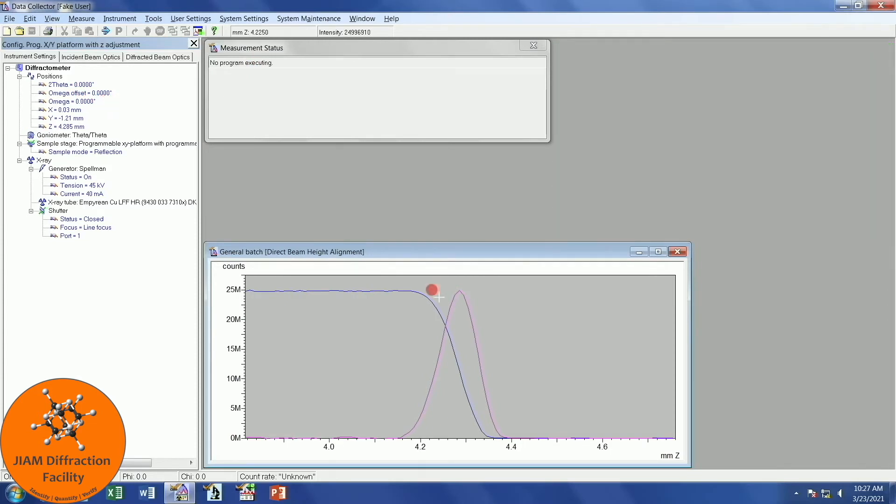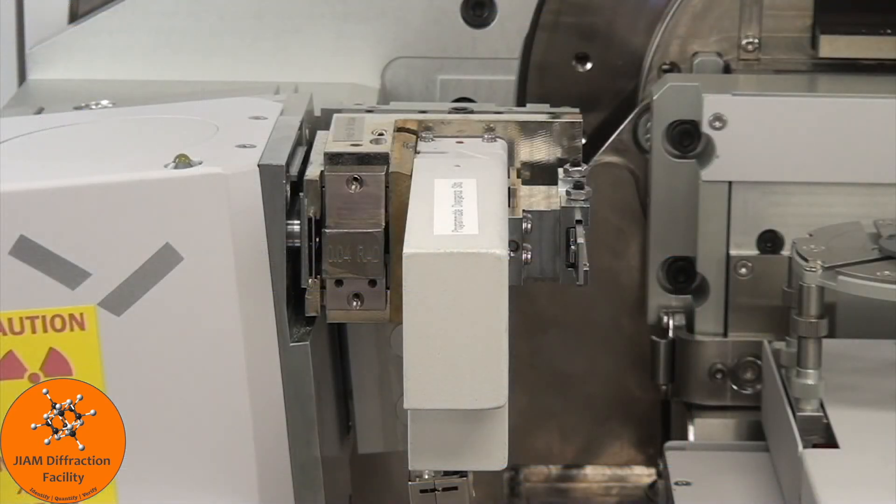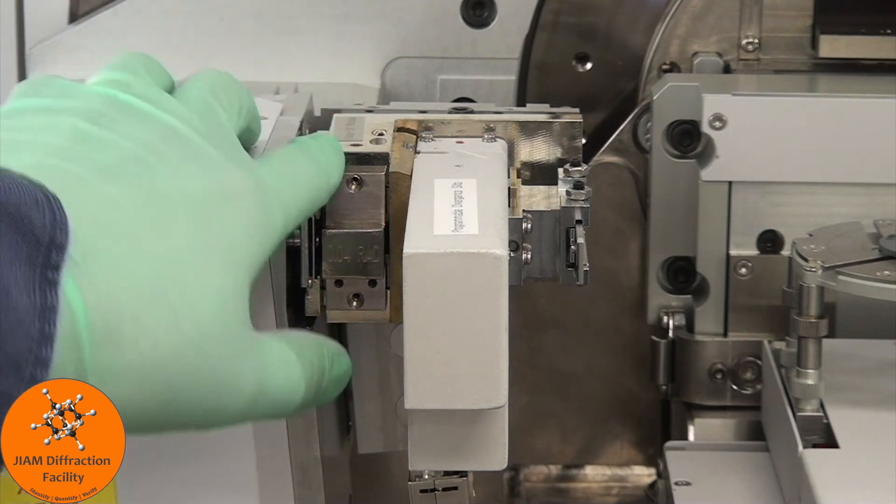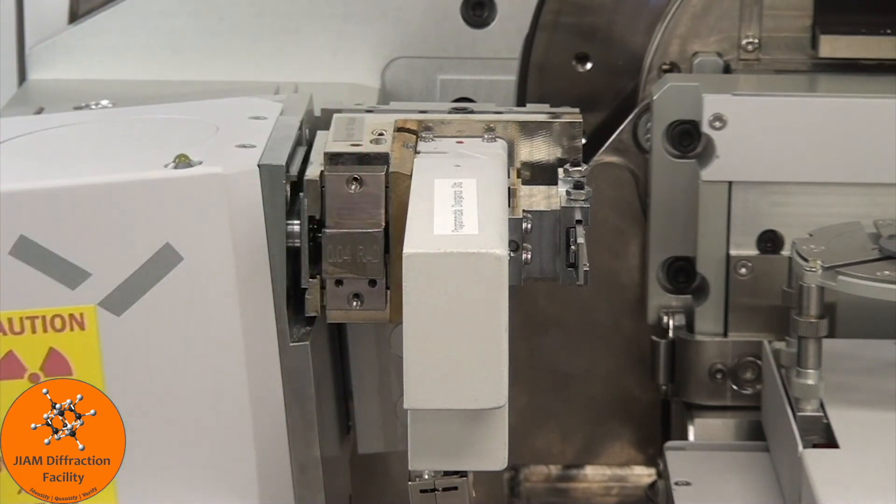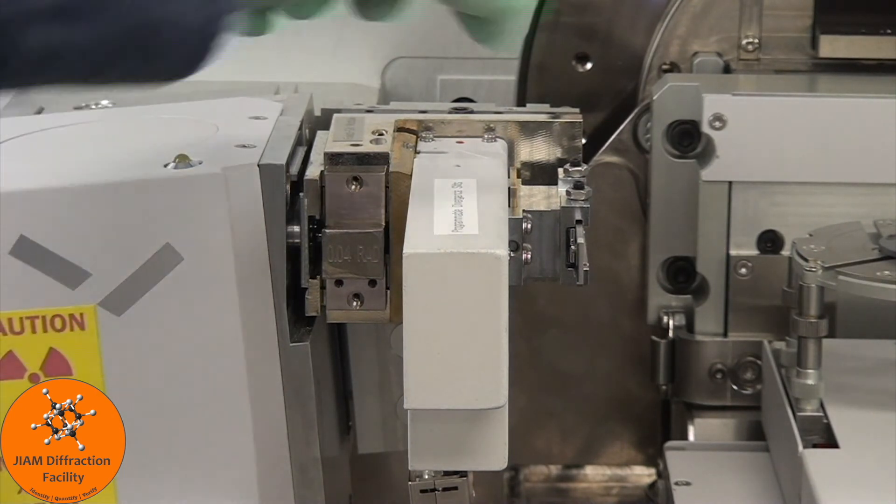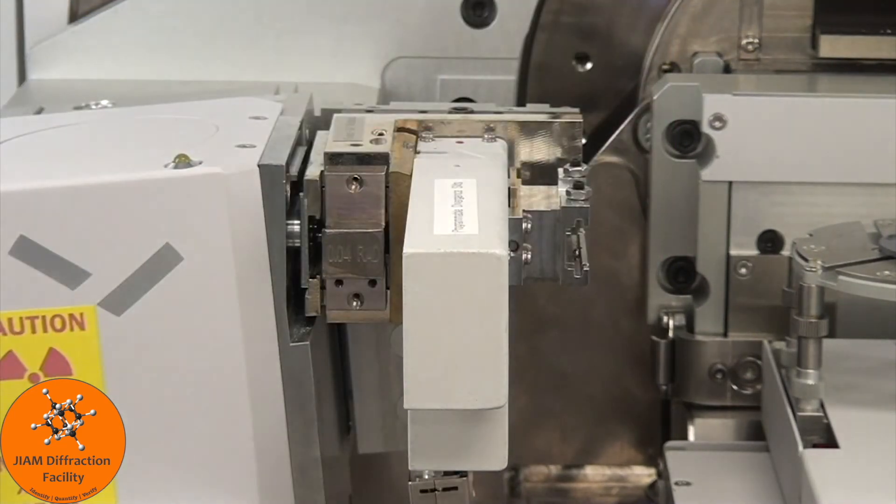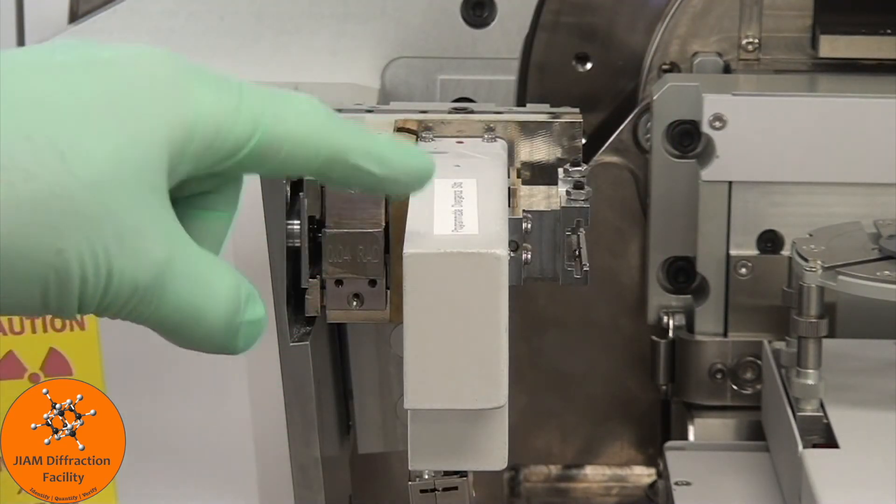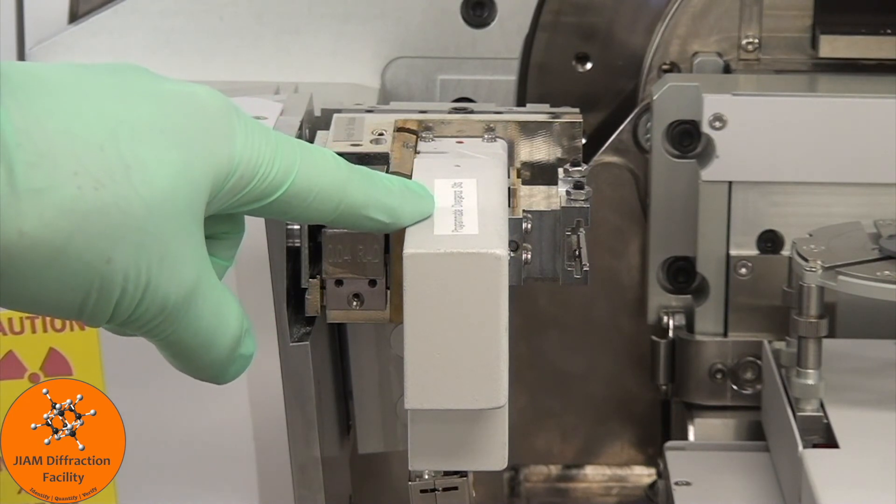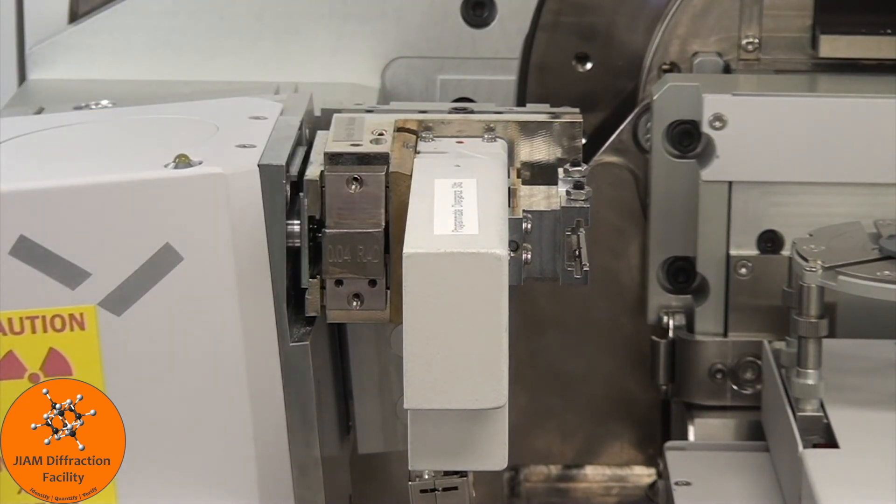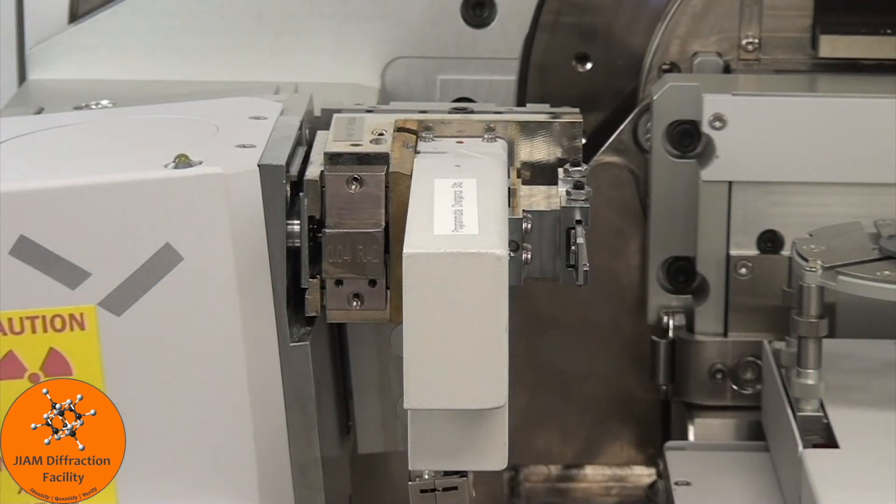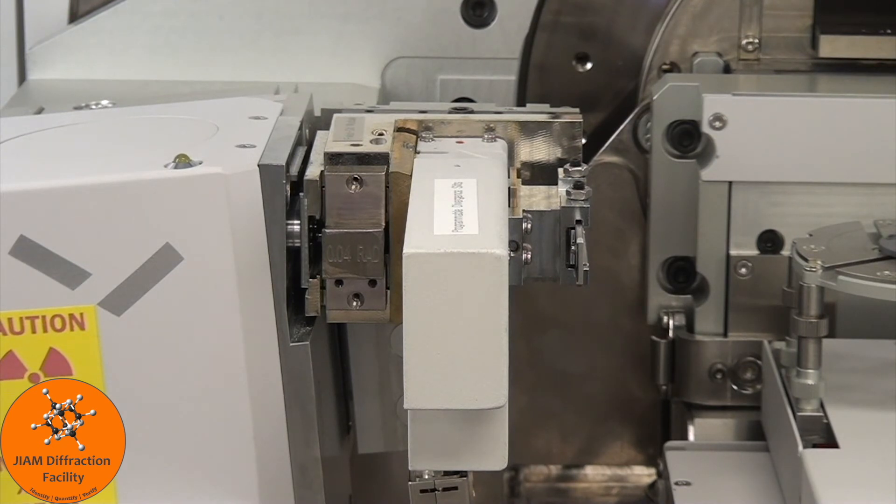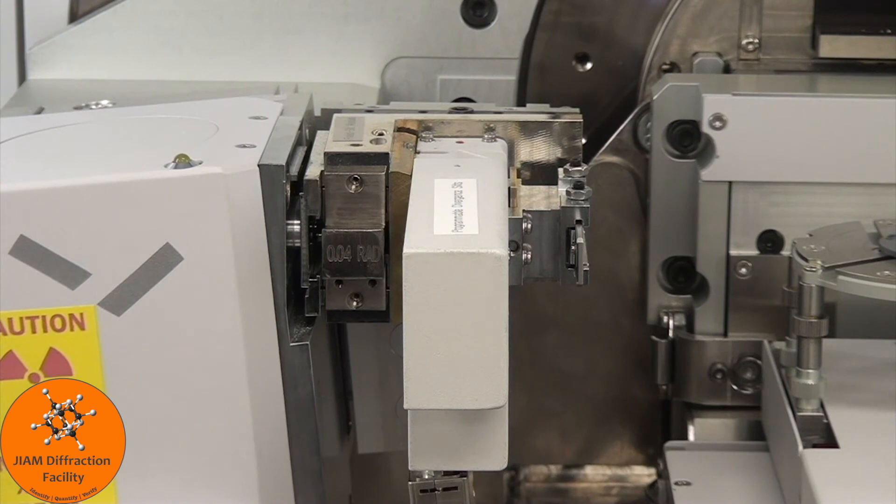We need to remove the attenuator. If you forget to do that, you will most likely get no signal when you try to collect your data. We will also change back the anti-scatter slit to whatever we want to use for our measurements. I'm going to use a one-fourth degree divergent slit, so I will change the anti-scatter slit to one half. And that is all we need to change manually on the incident beam side. On the diffracted beam side, nothing needs to be manually changed unless you removed the solar slit for alignment. If you did that, reinsert it before making your measurements.